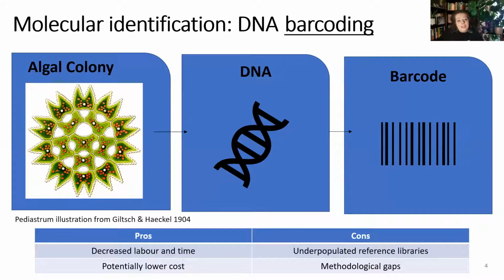An appealing alternative to traditional microscopy lies in the realm of molecular identification. One such method, known as DNA barcoding, involves the isolation and amplification of a single fragment of DNA from an individual target organism, which can then be sequenced and matched against a molecular database to obtain a species identification. This is becoming increasingly popular as high-throughput sequencing gets better and cheaper, and we expect to see this method increase in popularity in upcoming years.